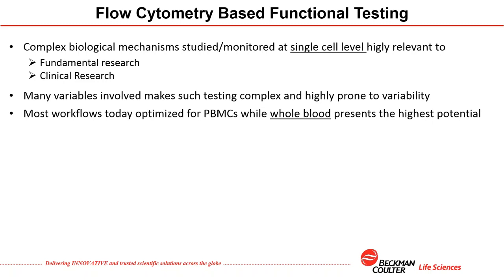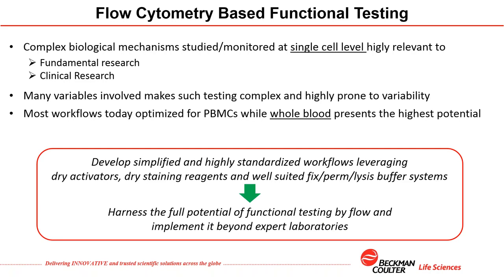There is also one limitation of most of the functional assays being performed as of today. This is related to the sample they are using. In most of the cases, these workflows rely on the use of PBMCs, while we believe, and it is usually acknowledged, that whole blood can bring much more informative assays. This is really the sample that brings the biggest potential.